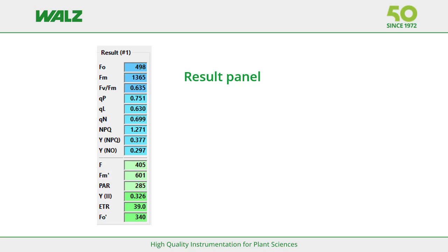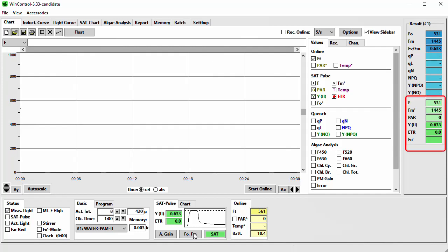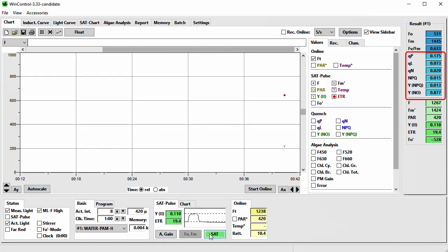The Result panel shows numerical values of the FO/FM and the last saturation pulse measurement, as well as calculated parameters. In darker blue are the fluorescence data of the FO/FM measurement of the dark acclimated sample — FO/FM and the maximum photochemical quantum yield of PS2. In green are the numerical values of the last saturating flash experiment; if this was an FO/FM measurement, these values are identical to the upper ones. With the next Satpulse measurement, new numerical values will appear, and quenching parameters will also be listed in light blue. For more information about the parameters, please read the corresponding chapter of the manual.